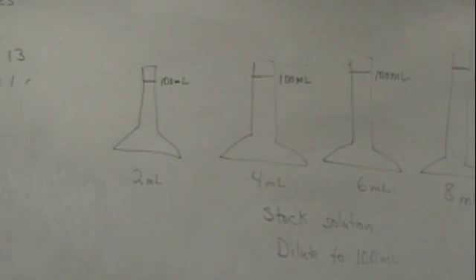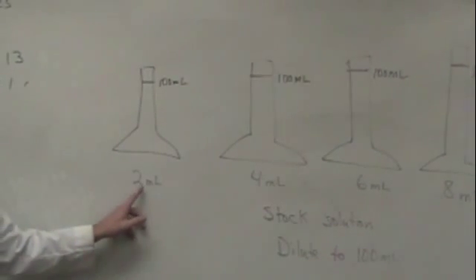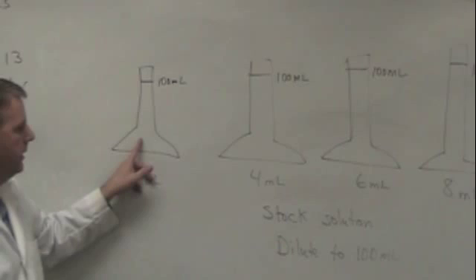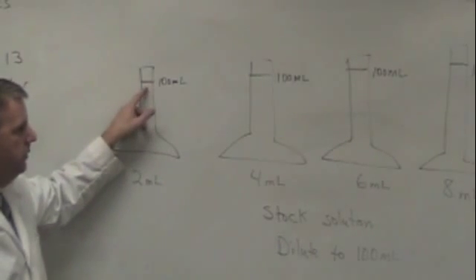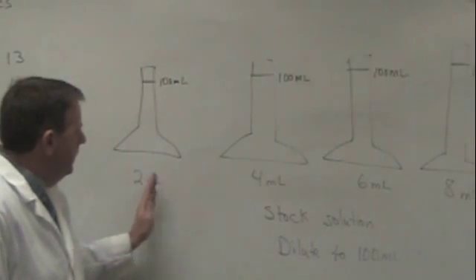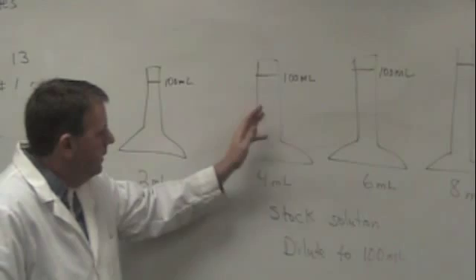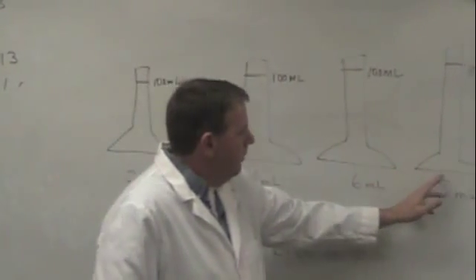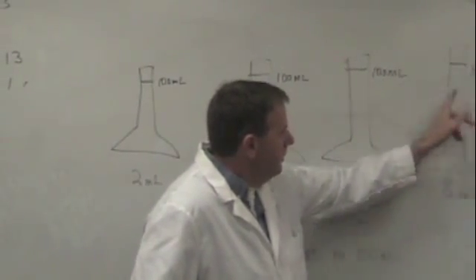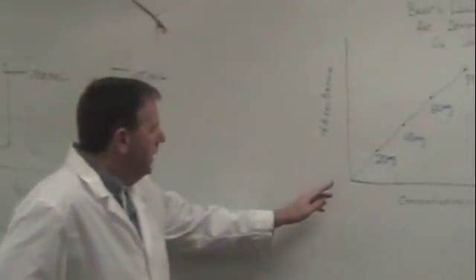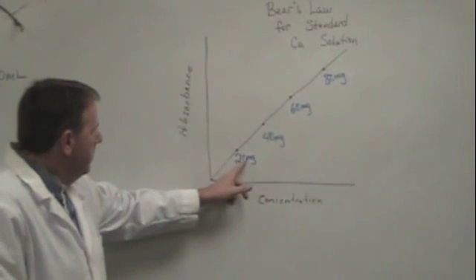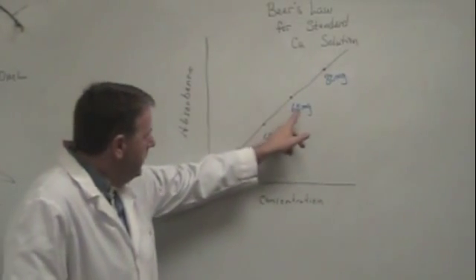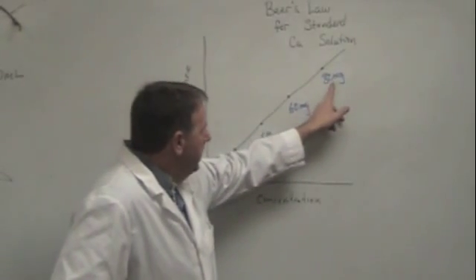To make our known solutions, we want to add 2 milliliters of the stock solution, which is this blue stuff right here. We want to put it into a 100 milliliter volumetric flask and dilute to the 100 milliliter mark. If we do that with the 2, then the next bottle we'll do 4 milliliters to 100 milliliters. In the third bottle we'll do 6 milliliters of the stock solution to 100 milliliters. In the fourth flask we'll do 8 milliliters and dilute to 100 milliliters. If we do that, we will end up getting our known solutions where we would have 20 milligrams of copper per 100 milliliters of solution, 40 milligrams of copper per 100 milliliters, 60 milligrams of copper per 100, and 80 milligrams per 100.